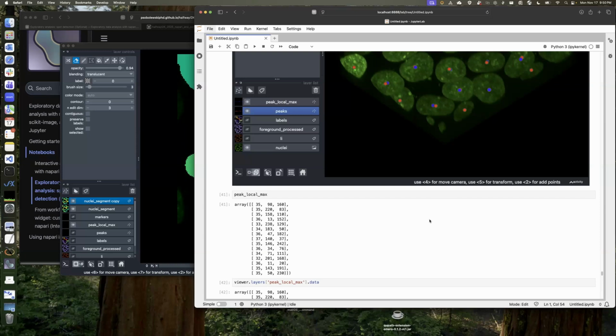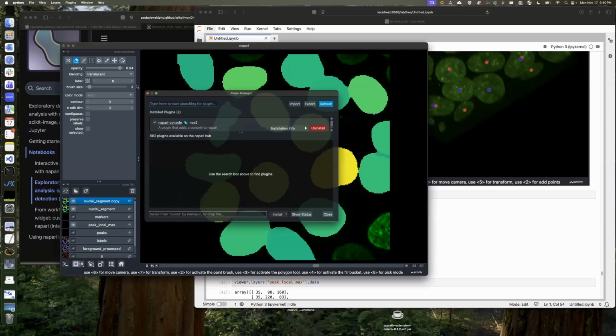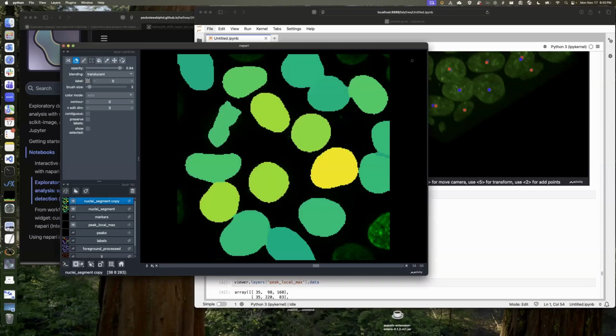Fiji has a ton of different plugins and has been around for a long time. I used it in grad school, which would have been 25 years ago. And Napari is only like 6 years old, so Napari is a lot younger. While we do have a lot of plugins, there's not nearly as many options for Napari as for Fiji. What other differences are there? Yeah, Fiji's in Java, so in some regards that's easier, but in other regards it's not so great.